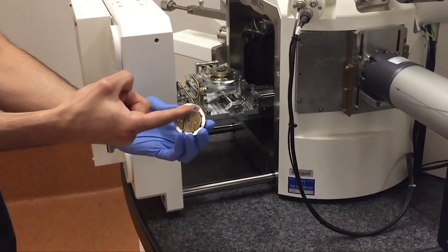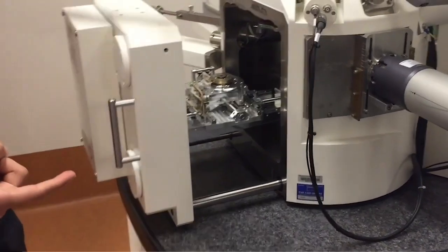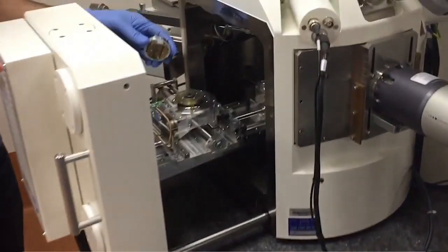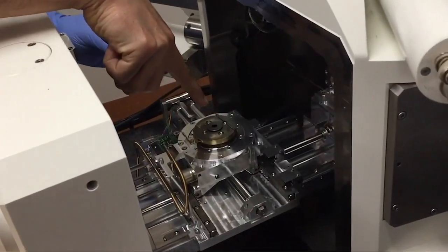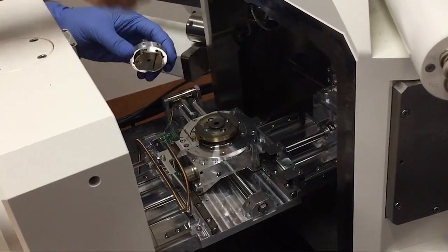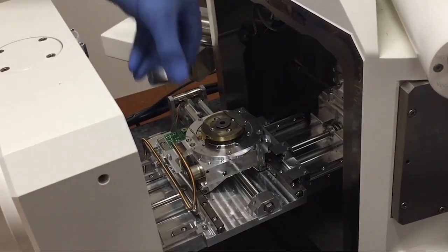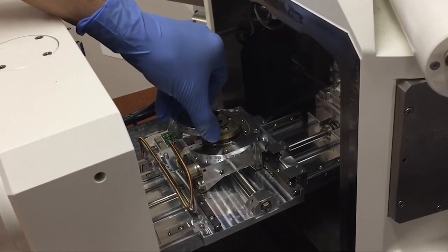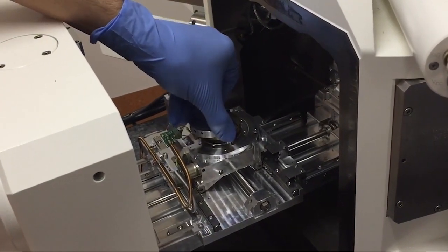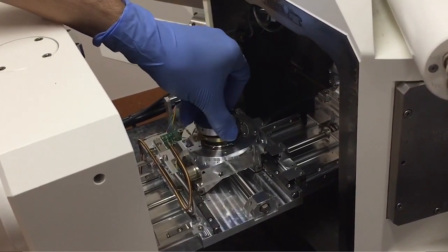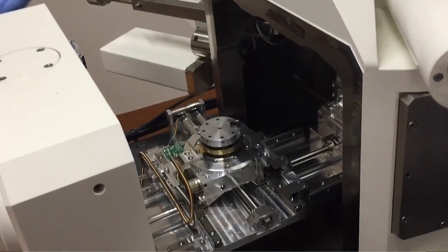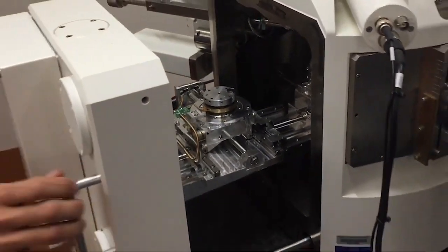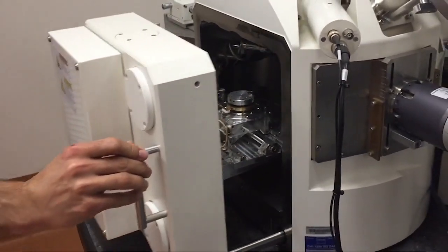Slide the holder onto the stage mount. The brass dovetail on the holder base has a flat edge, and this should locate against the stop bar on the stage. The holder should be concentric on the stage.